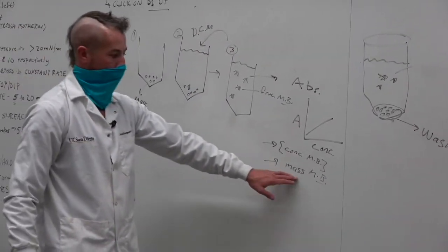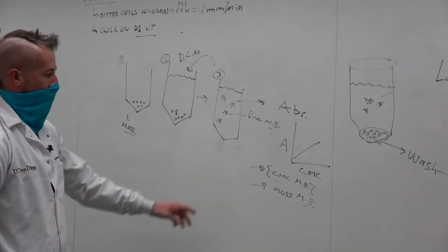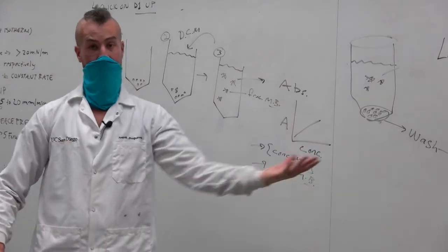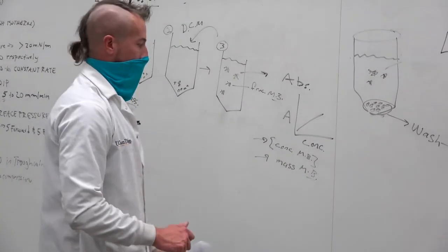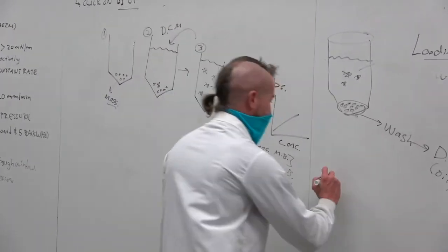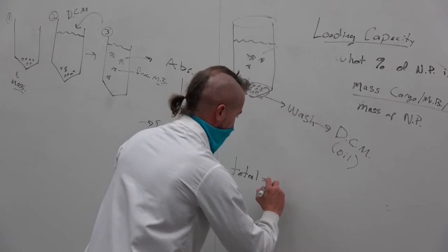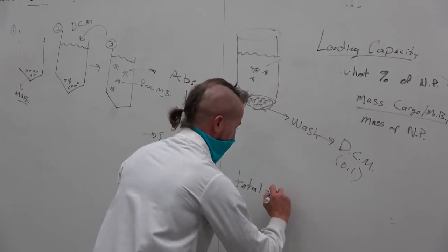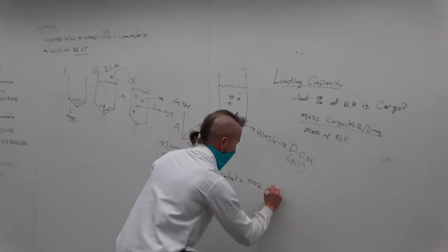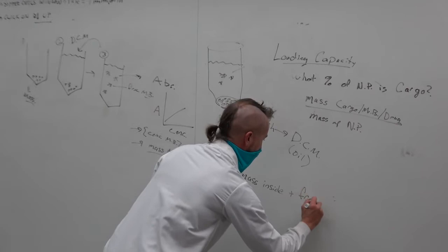So it will be kind of fun to see how close this matches what you calculated earlier, right? Does total equal mass inside plus free?